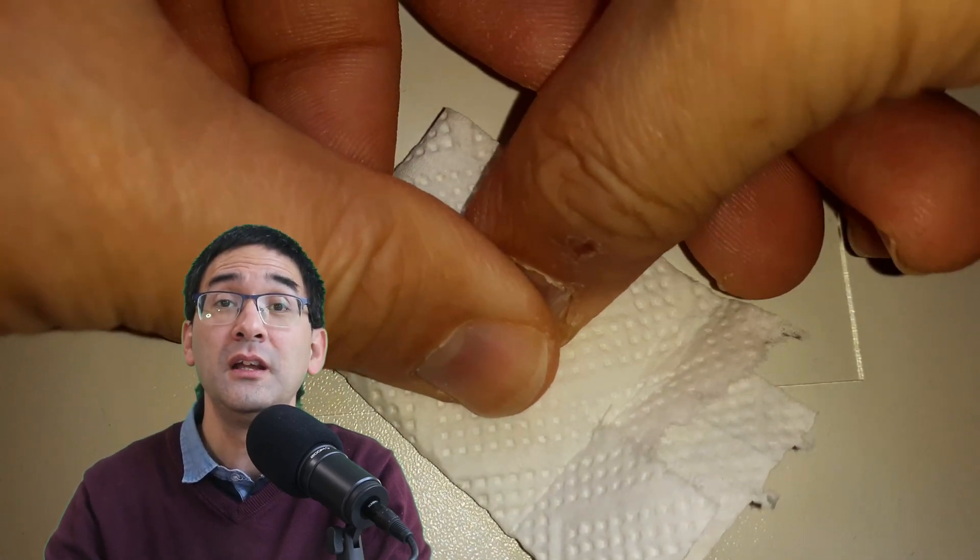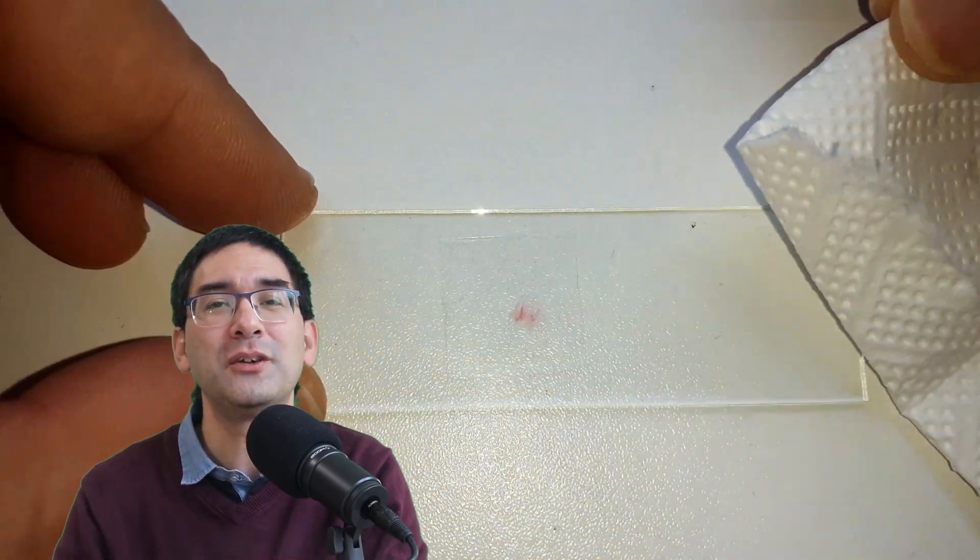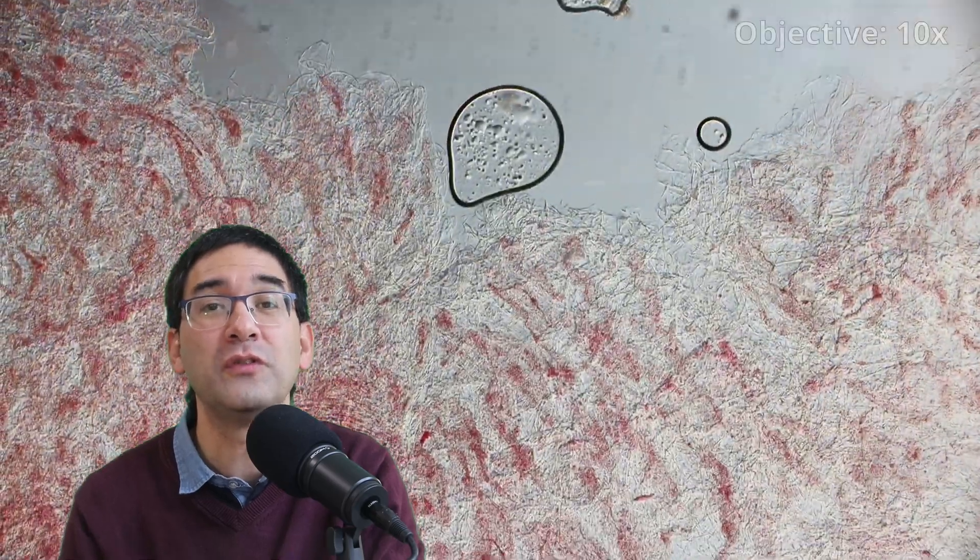And this makes it thin enough to be directly observed under the microscope. And the first result was not very interesting.